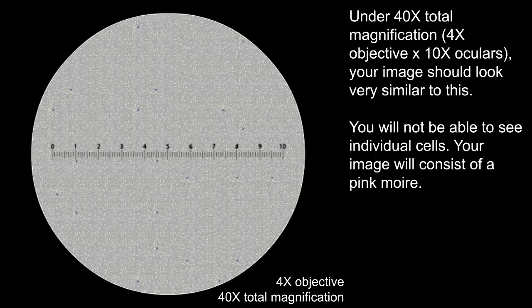Under 40x total magnification, your image should look very similar to this. You will not be able to see individual cells. Your image will consist of a pink moiré.